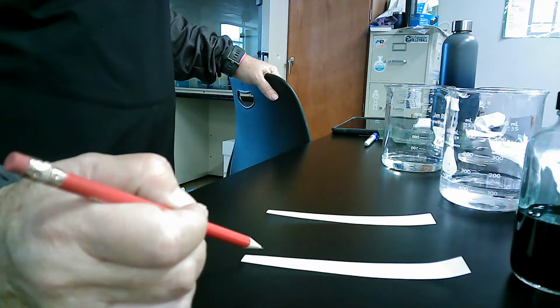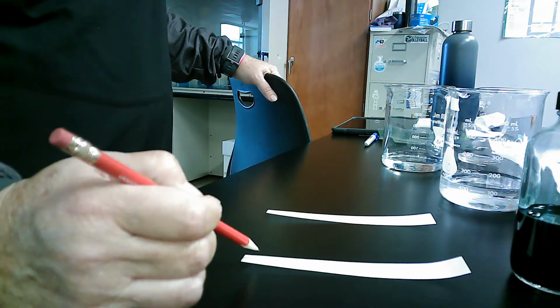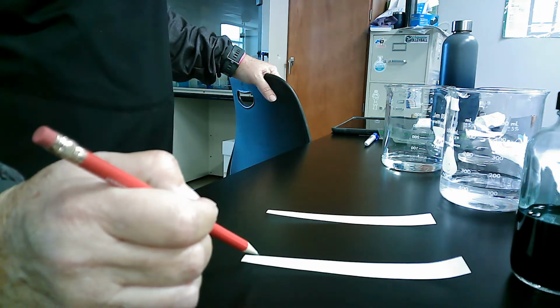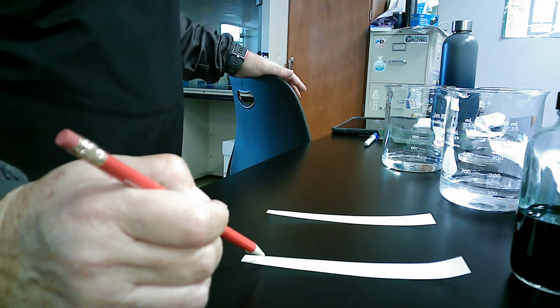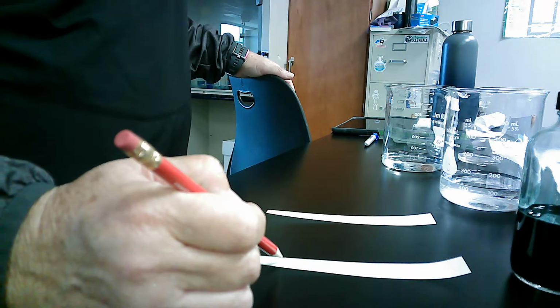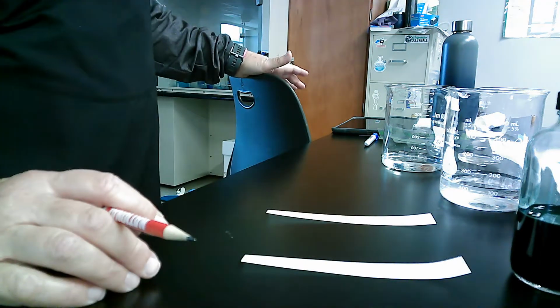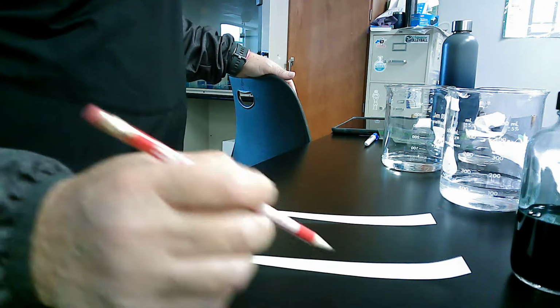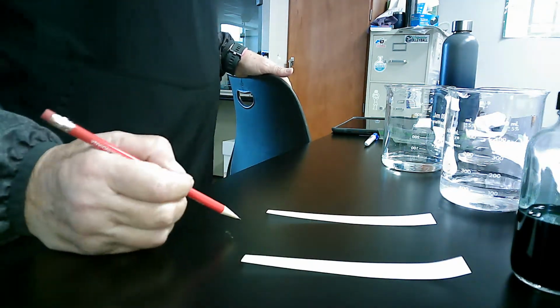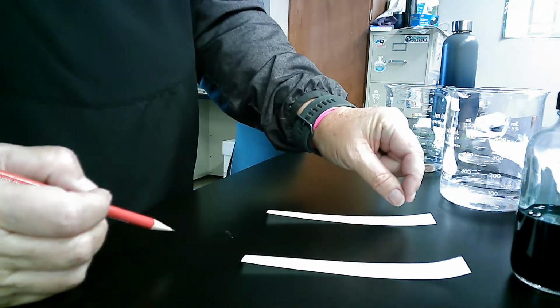So the rule is like dissolves like, so polar will go with polar, nonpolar with nonpolar. If I have a polar solvent, any polar molecules in whatever I'm trying to separate will carry along with it, and then will start to drop off as they're not as comparable. Whereas things that are nonpolar will not go with it. Vice versa, if I had a nonpolar solvent, then a nonpolar substance would want to go along with it.